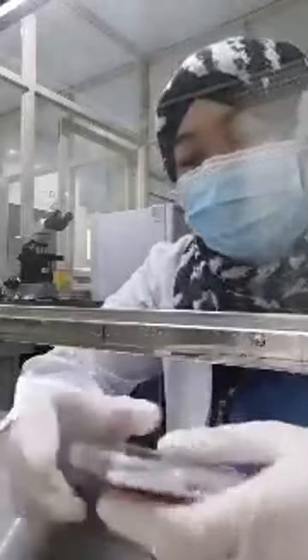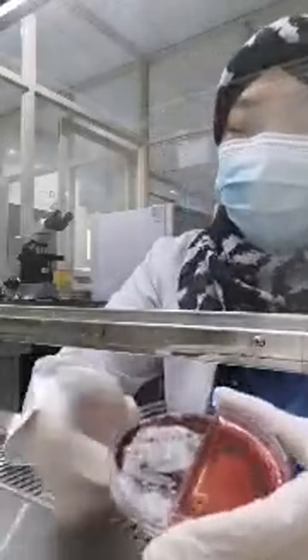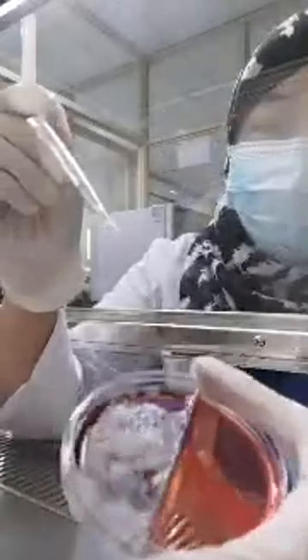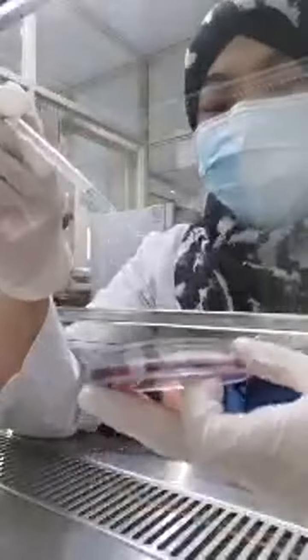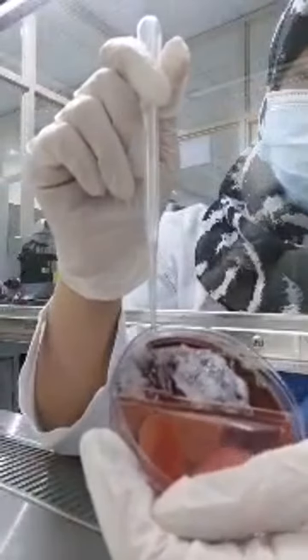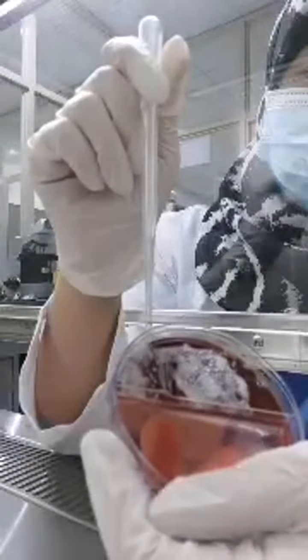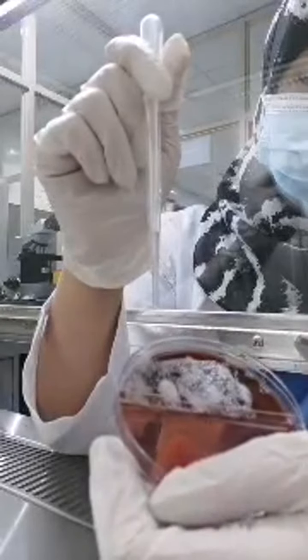So the only one that will form bubbles here is the staph. The Candida will not. In person you can see it. If I drop it here, some will form bubbles and some will not, because there are two colonies here.